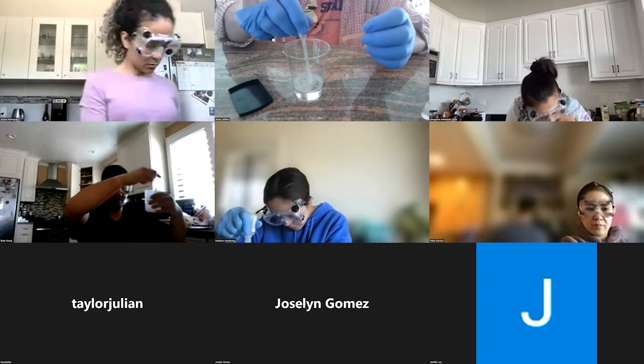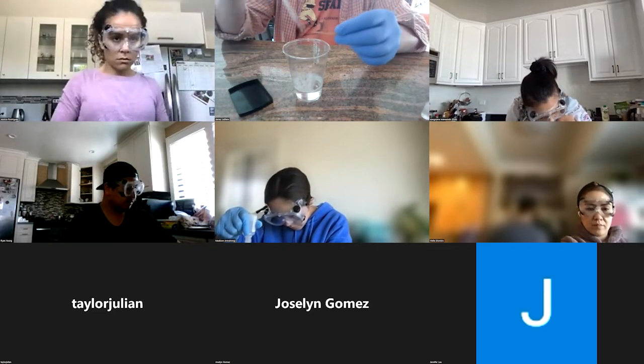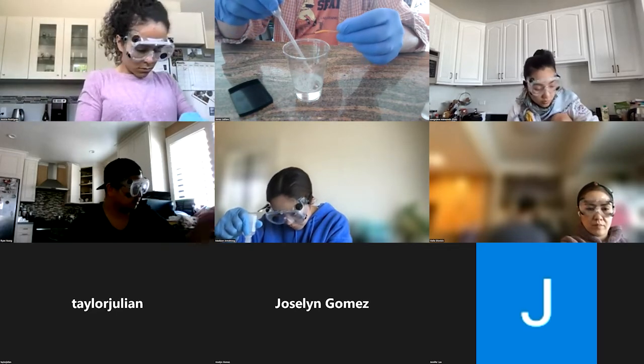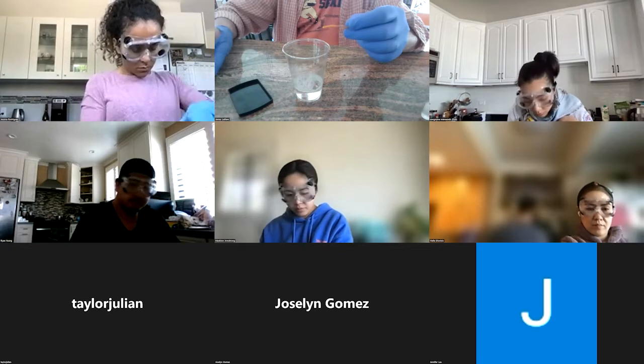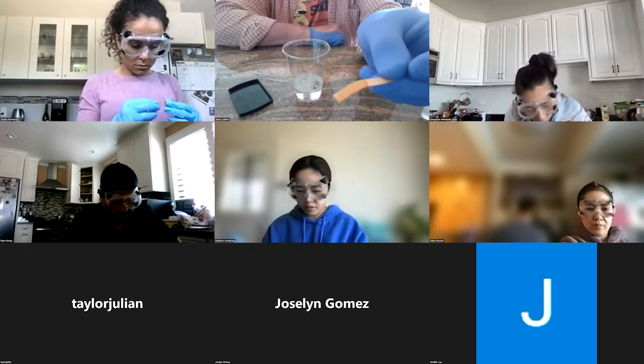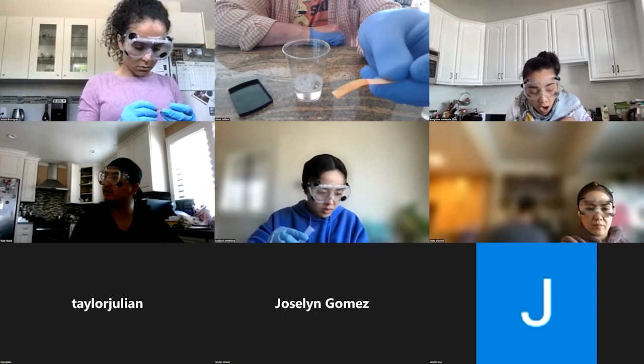So I'm just going to take a little drop, wet it, and then just let it sit. The color will take a while to develop.